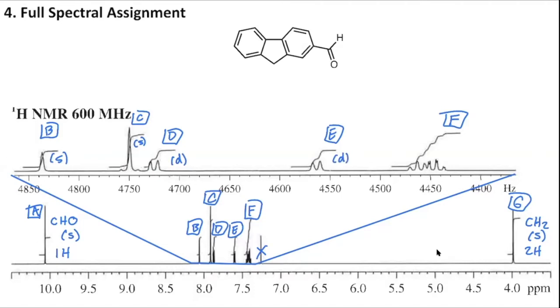And then we come to F. What is going on at F? I would classify this as basically a hot mess of weird peak splitting. Because of that, we're not going to be too concerned with you telling us the very fine, detailed, exact type of splitting that's happening here. If we had higher resolution or a bigger zoom, we could get a better idea.